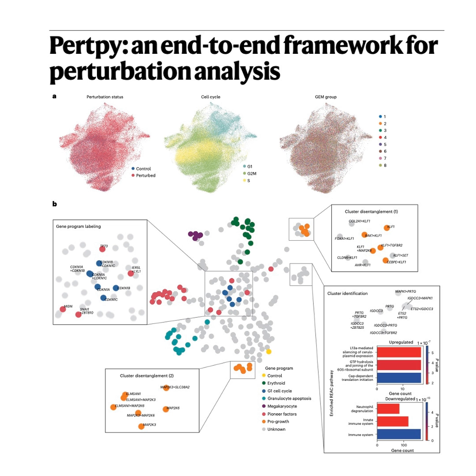That's where the heavy-duty stats come in. Pertpy has a more sophisticated tool, the Poisson-Gaussian mixture model. This doesn't just use a fixed threshold. Instead, it statistically classifies cells based on whether they belong to a high-expressing population for a given guide. So it's learning the difference between background noise and a real signal. Precisely. And that makes it incredibly robust for both low and high MOI screens. It's just a more nuanced, statistically solid way to make the call.